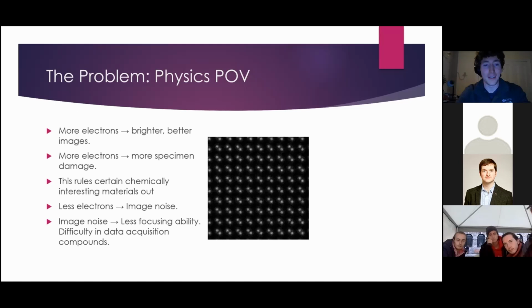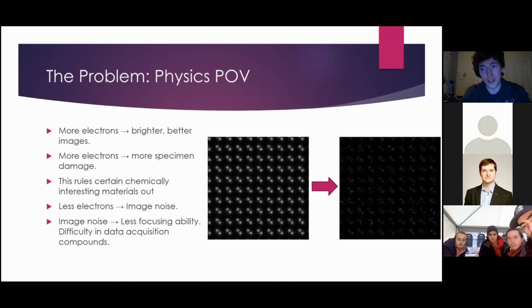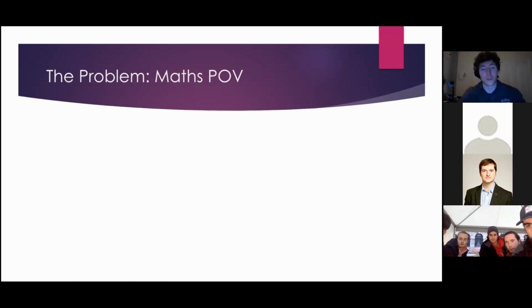the poor image quality affects your ability to tune the equipment. And so in addition to it being noisy because of the amount of signal that you're throwing at your specimen, it's doubly ineffective because the equipment could be so much better tuned at the microscope, but that's just beyond you at the minute because you're working with images like this. Now, this is the complete opposite end of the spectrum entirely. This image here is 10,000 electrons per angstrom squared, whereas this is about 100. You usually wouldn't go around this range because it's the same material, but I mean, you can make out nothing of it.